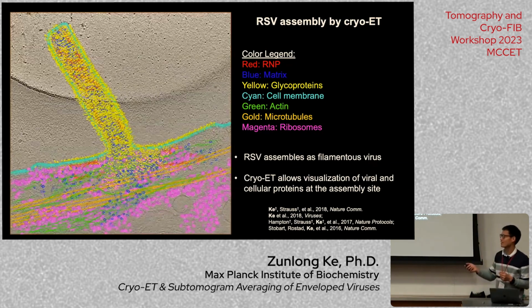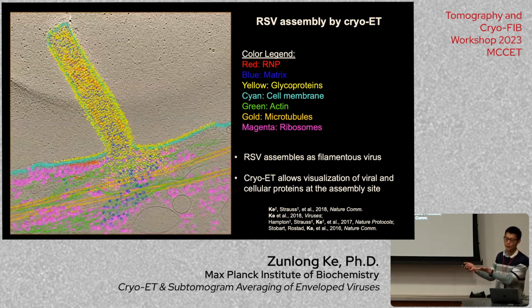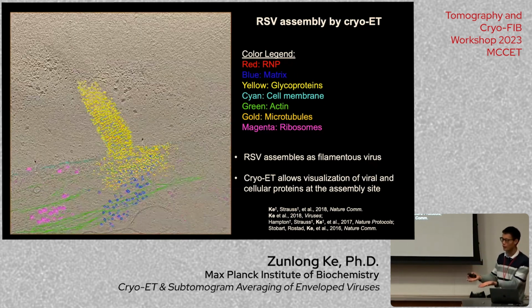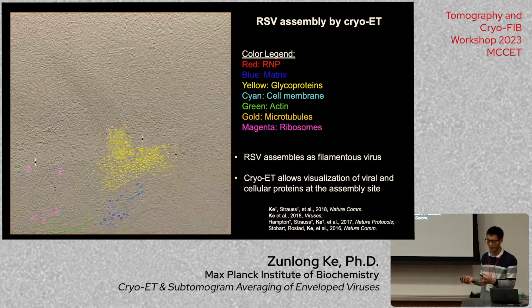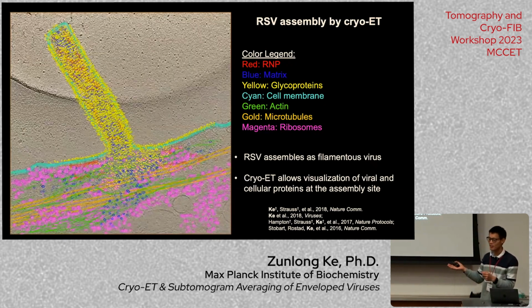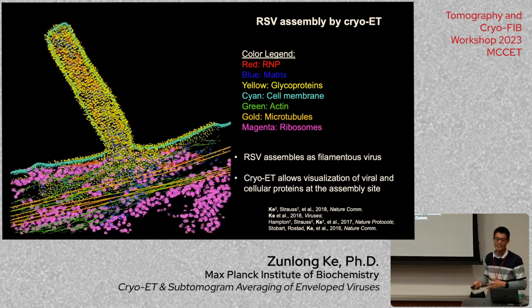You can also see this is not even in the hole, it's on the carbon. But in cases like this, in cellular tomography, when you have a really lovely target, you just take it, but also be selective still.